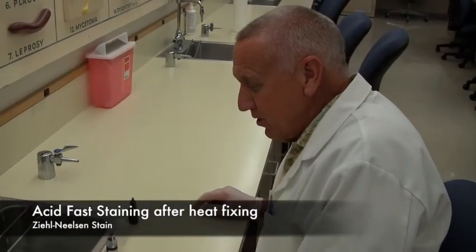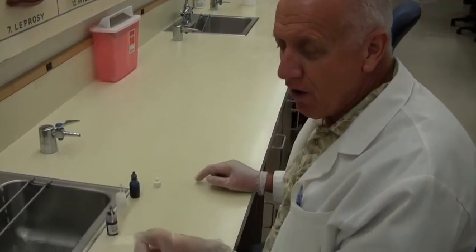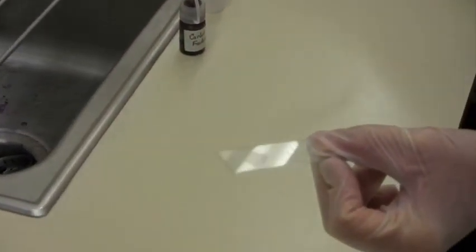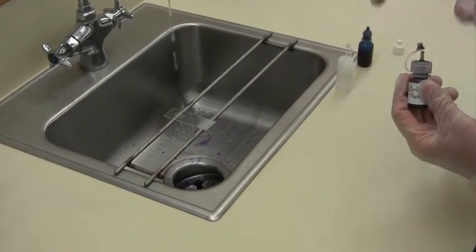Now I'm going to show you how to do an acid-fast stain. I have already prepared sputum slides for you, and they already are heat fixed. So ordinarily you would make a smear and heat fix it, and then start your staining. The staining procedure is very simple.